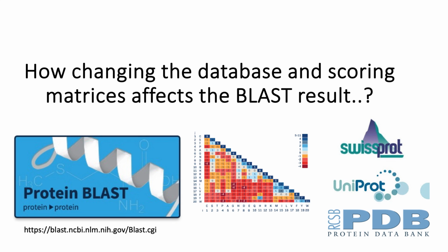So now that we have our initial results, let us explore how changing the database and scoring matrices can affect the BLAST result. Different databases may contain varying sequences, and different scoring matrices can influence the alignment score and E values, providing deeper insights into sequence similarity. Next, let's change the database and scoring matrices to see how it affects the results.